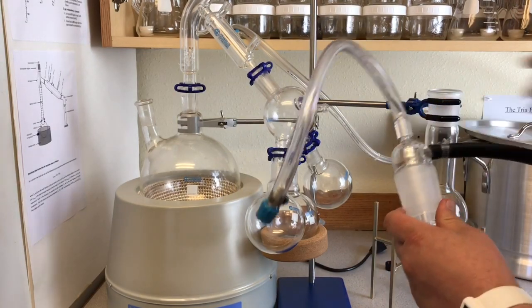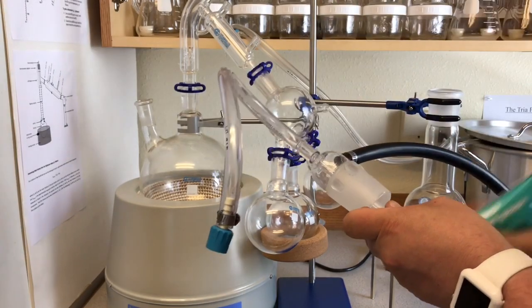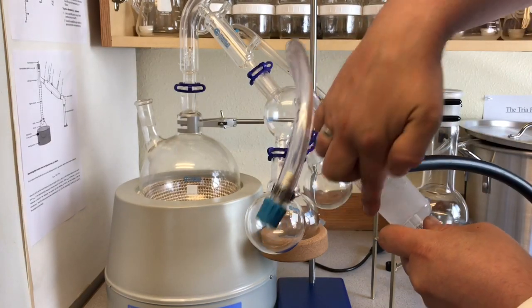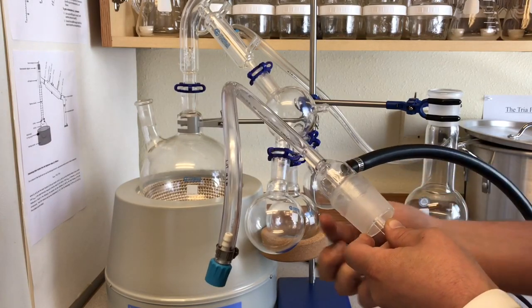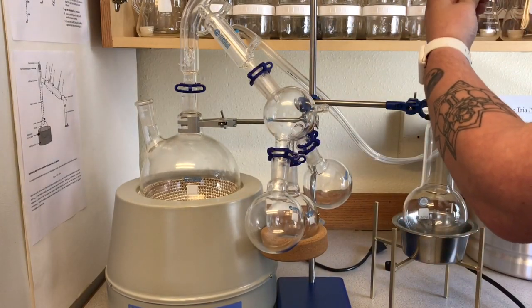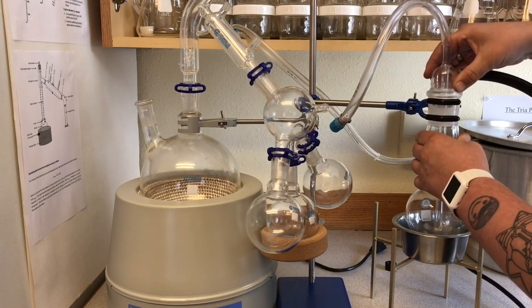So again, we'll take our Dow Corning vacuum grease and we'll just put a little bit here and make sure that we've got a nice good seal on there. It really doesn't have to be perfect, and I just take the vacuum grease and just do about the top half of the male connection. I never put my vacuum grease on the female connection. You're looking for a big mess that way. So I'll just gently lower this guy into here, turn it back and forth a couple times, and you can see that it gets this clear look to it. And we're all set there.